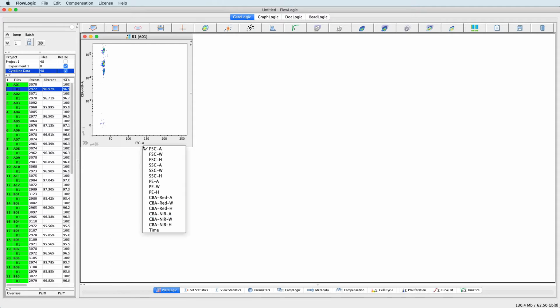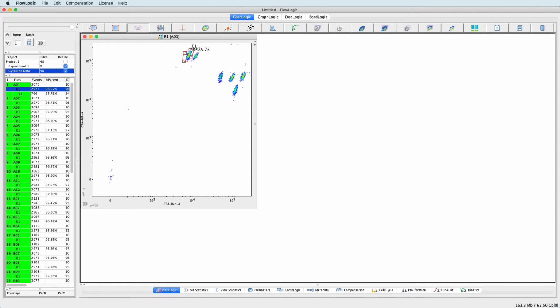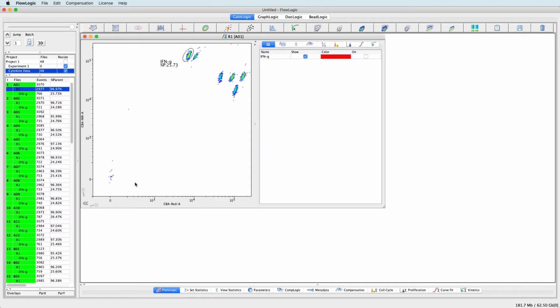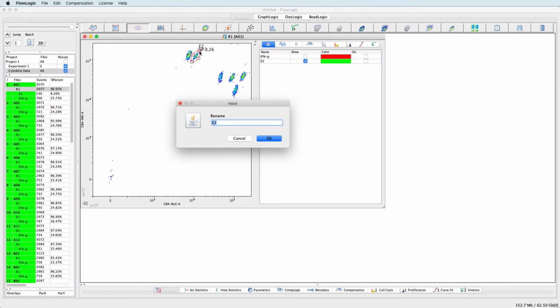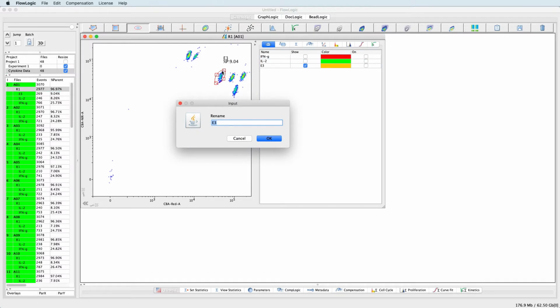Once the correct combination of parameters is selected in order to identify individual populations, apply the appropriate gates and rename the gates to match the analyte name, in this case, particular cytokines. As many of the populations exist in close proximity to each other, one tip is that once the gate has been created, in the plot side drawer, navigate to the Gate List tab and untick the box in the Show column to turn off the gate. This will simply hide the gate rather than delete it, and therefore prevent you from accidentally adjusting the wrong gate.